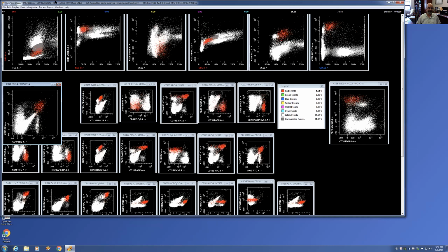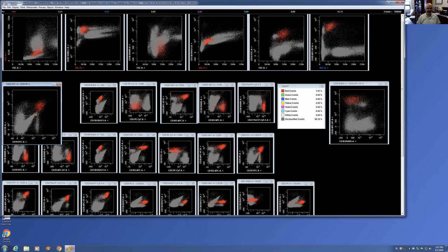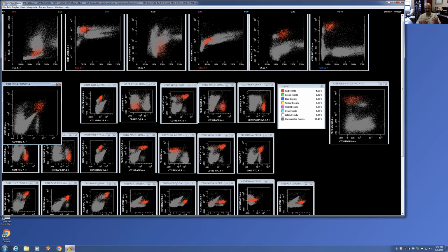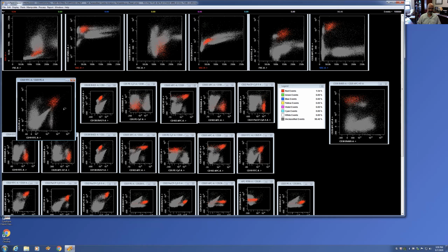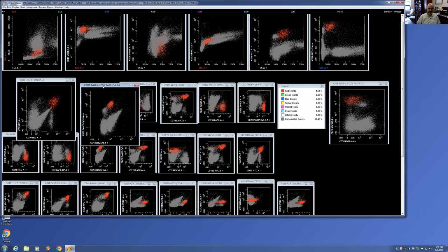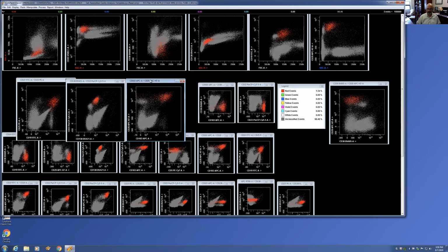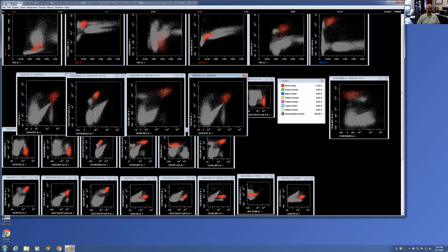that, let me get rid of the white here. And while you think all these clicks and everything is less efficient and might be slow, it's really not once you get used to it. This can go much faster than the back and forth that happens in regating and reevaluating. So CD20 bright, so I'm going to hone in on that cluster. And now I'll let you look at these markers. Look at these 4 plots. All the axes, you can pause if you want, and then let me know the diagnosis.